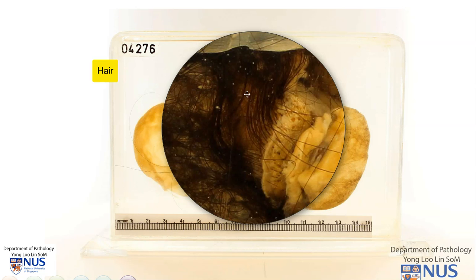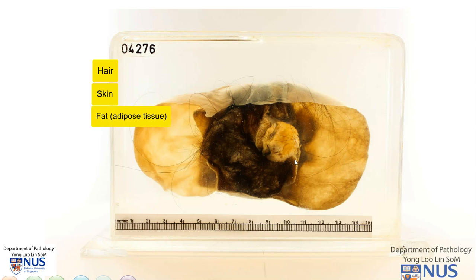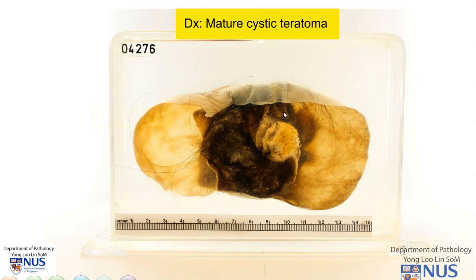In this area, there is a brownish area that resembles skin. This is likely to be epidermis, and then we have the subcutaneous structures. This yellowish area may represent adipose tissue or fatty tissue. The diagnosis here is a mature cystic teratoma of the ovary.